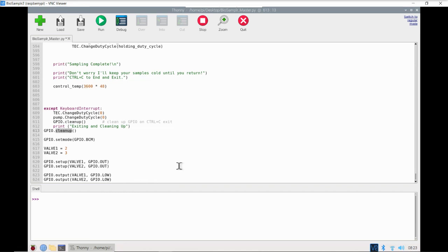So that's it for the master script. It is pretty bare bones, but it will get you taking samples, and some of those values may need to be calibrated for your individual device. But that is the basic script.